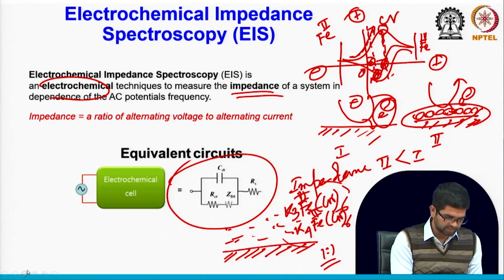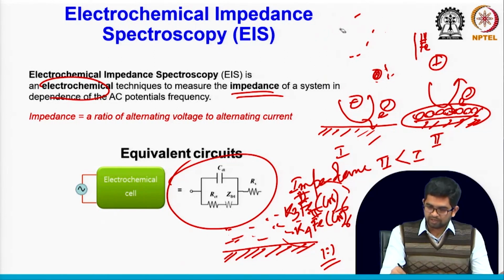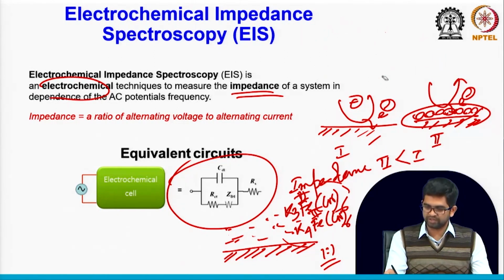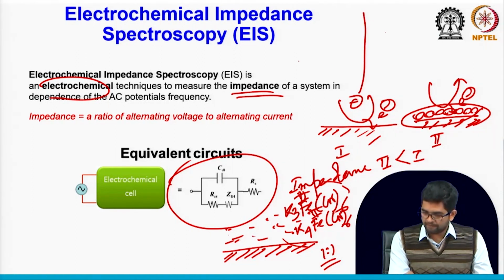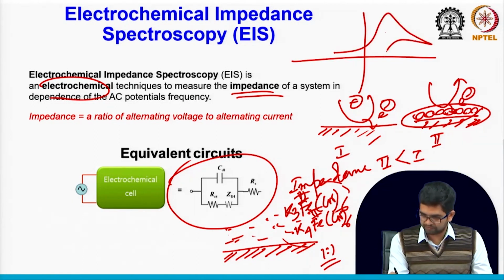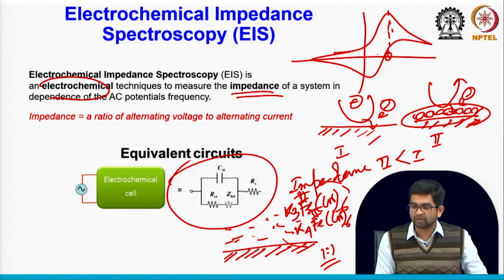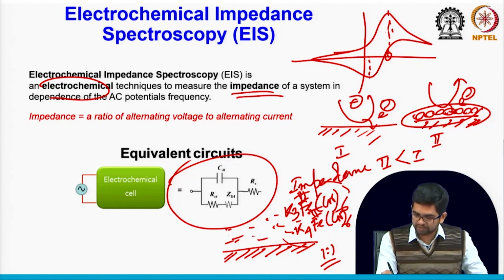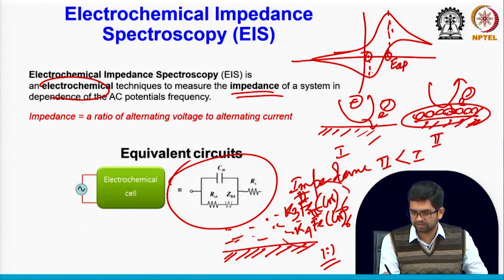Okay, let us plot it clearly. I will show you, it is much easier. Let us see how to calculate the formal potential. We definitely need the formal potential before collecting our impedance data. So, this is your cyclic voltammetry, right. This potential will be your oxidation peak potential, and this potential will be your reduction peak potential, right. This is EP anodic, the anodic peak potential, and this one is the cathodic peak potential.